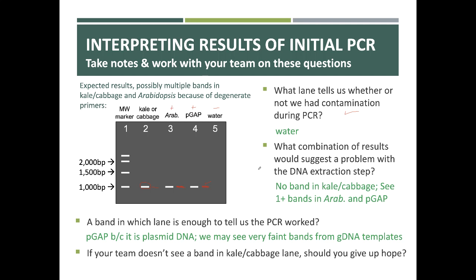If you're doing an experiment like this and you don't see a band here in lane 2, should your team give up hope? Well, of course not. And that's for a few reasons. Never give up hope, because the process of science isn't that it always works right the first time. It's that you investigate and figure out why something didn't work.